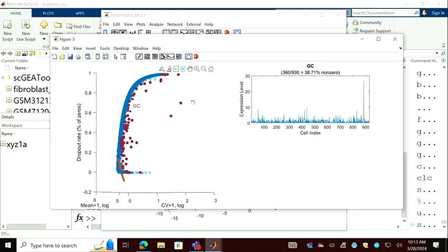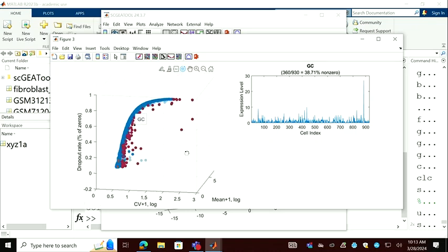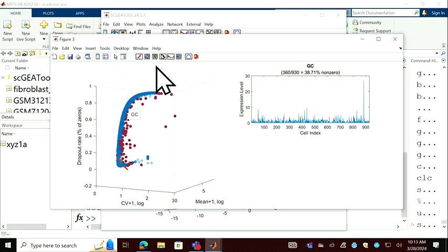Yeah, as I said, these two are contamination, the hemoglobin genes, the top two. But the rest of them can help you understand the function. So once you select those genes, you can save the gene names into a table for downstream analysis.